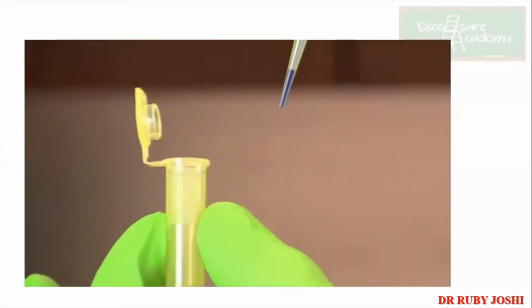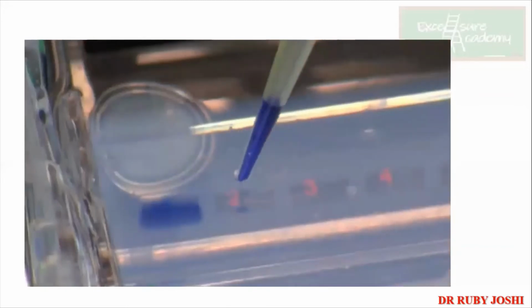When loading the samples, keep the pipette tip perpendicular to the row of wells. This will reduce the risk of accidentally puncturing the wells with the tip. Lower the tip of the pipette until it breaks the surface of the buffer and is located just above or just inside the well, so it is remaining in the well only. It's all because of the glycerol added.